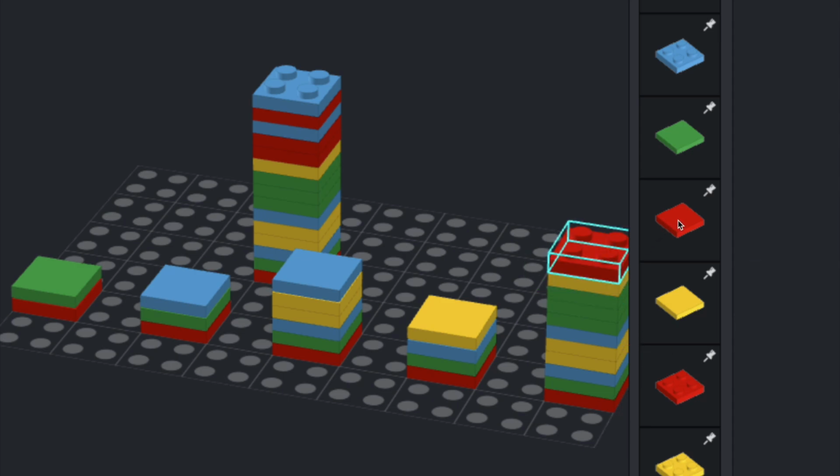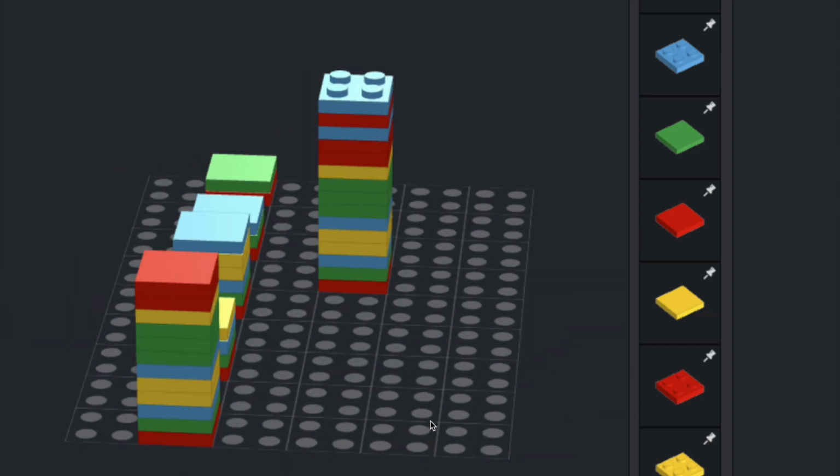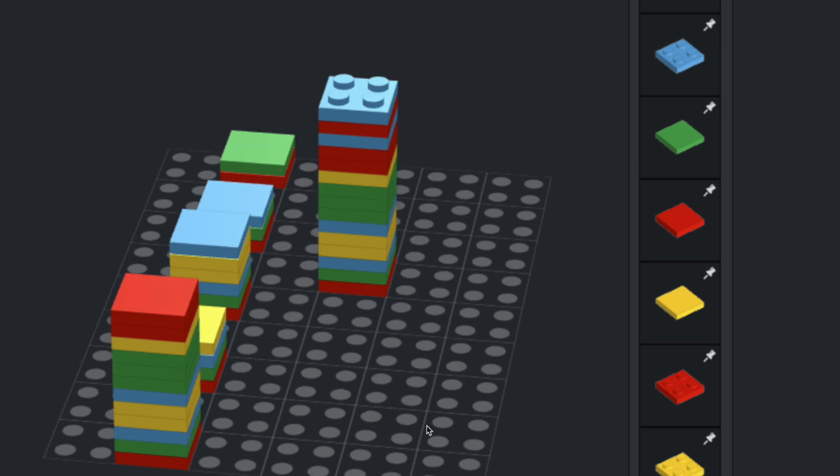And so those fluorescent molecules on the end of each of the blocks, when they go through the capillary, they all move at different rates because they're different sizes. And then the fluorescence is detected on the basis of the length of that molecule. So you can imagine this continuing on and on, and generating lots and lots of extra copies of various length molecules, all possessing a fluorescent tag at that last position.